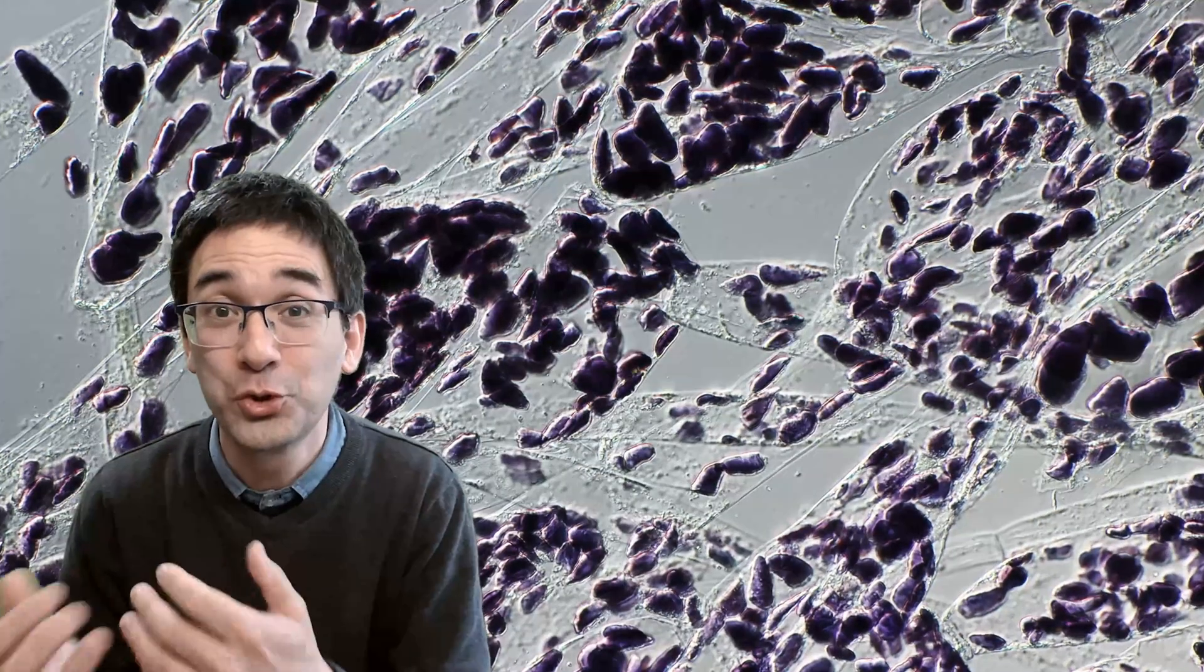Hello and welcome, microbe hunter here again. Those little dark dots that you see behind me, those purple colored dots, these are starch granules of a banana.